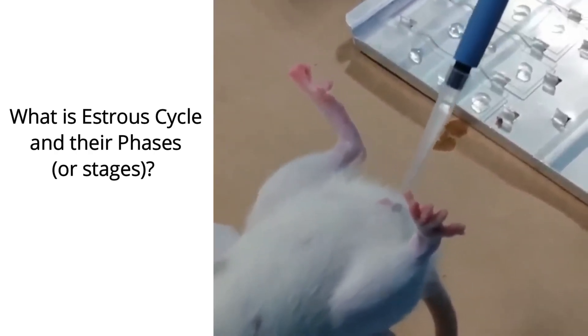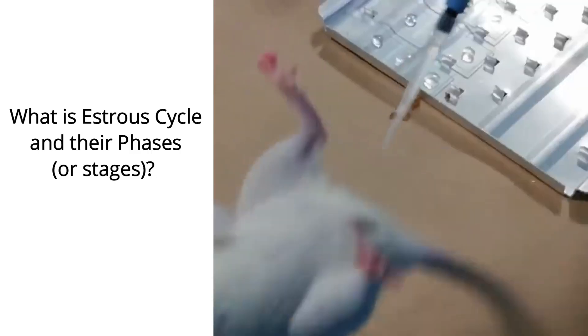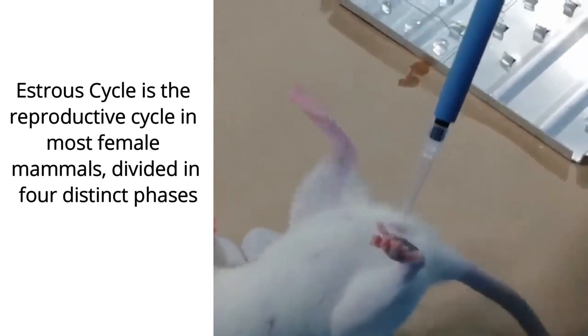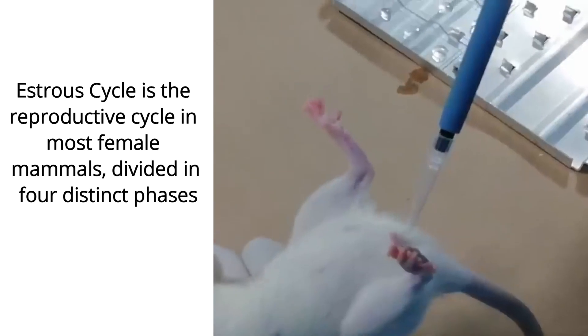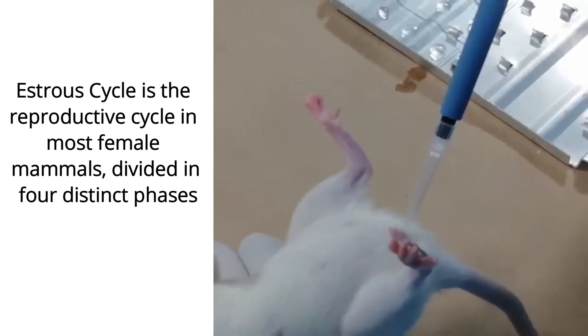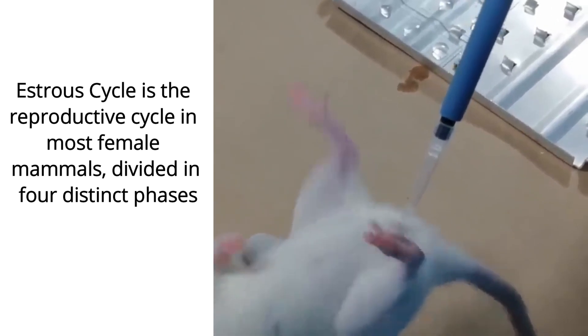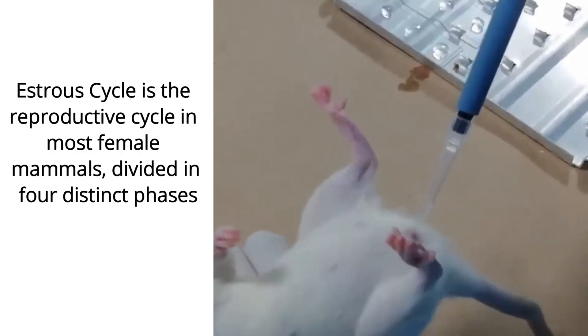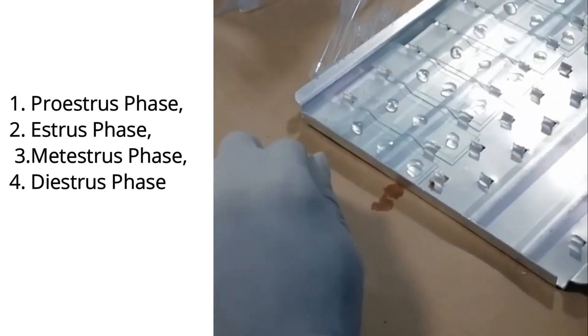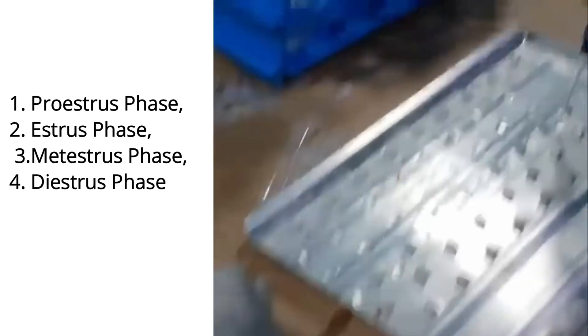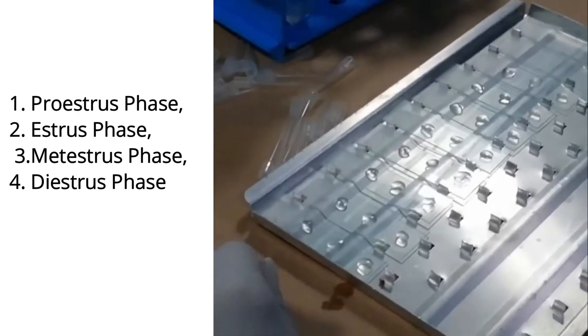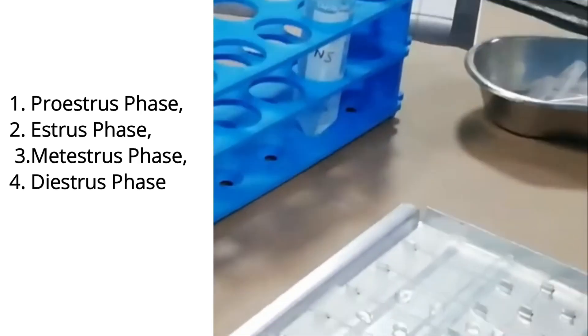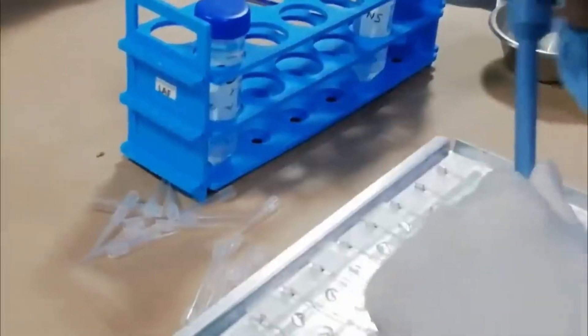Now we will see what is estrus cycle. Estrus cycle is a reproductive cycle in most female mammals divided into four distinct phases: the first phase is proestrus phase, then estrus phase, metestrus, and diestrus phase.